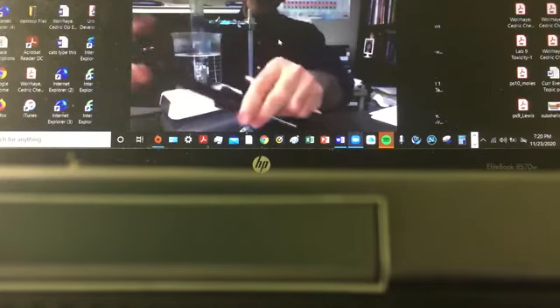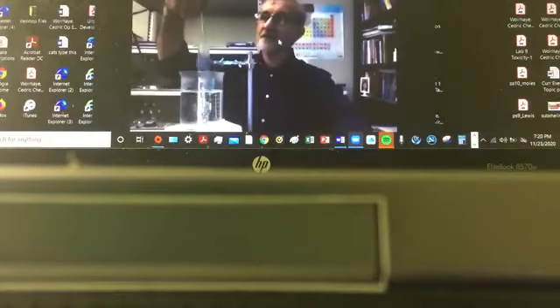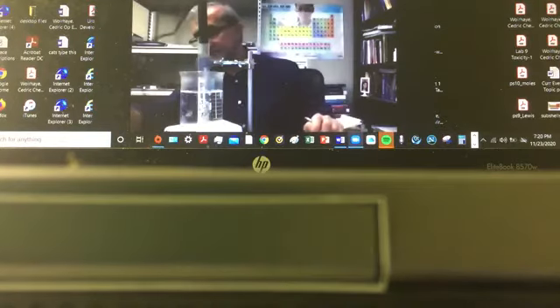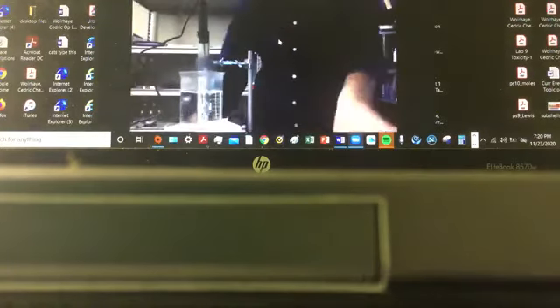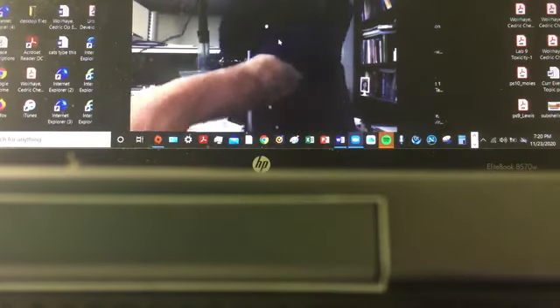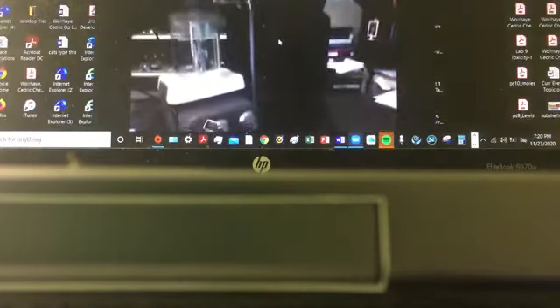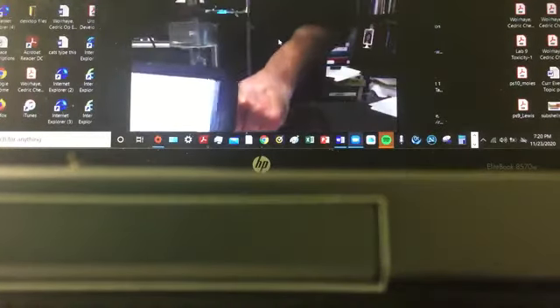So here's my thermometer. I want to add that thermometer on top of that test tube. So I'm snugging that thermometer on top of that test tube to be able to measure the environment inside that test tube. Okay. So a way to read the temperatures: the thermometer is plugged into the screen. So here's the thermometer screen. 31.